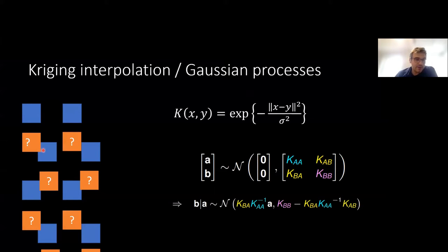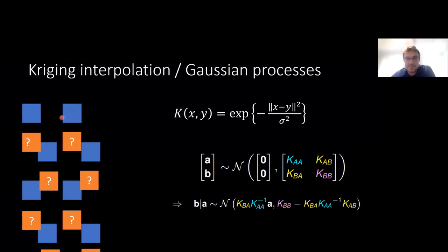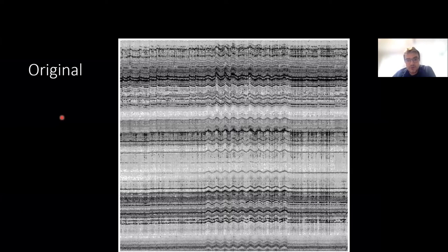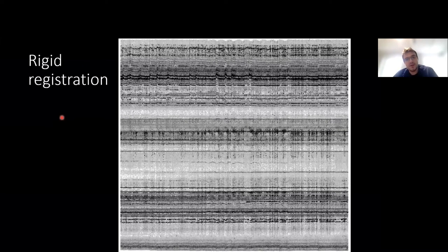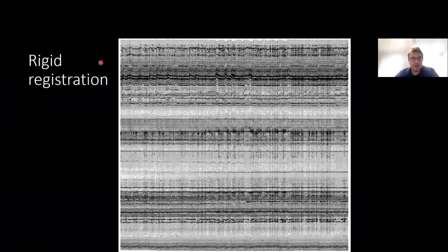With those two steps — drift estimation and reinterpolation to correct for drift — we can go back to our original data and look at what the same drift map looks like when run a second time on the registered dataset. The biggest patterns have gone away. There are a few little things left here and there — you can see maybe a little bit of motion remaining. Why would that be? Probably because the tissue around the probe does not move in a rigid way.